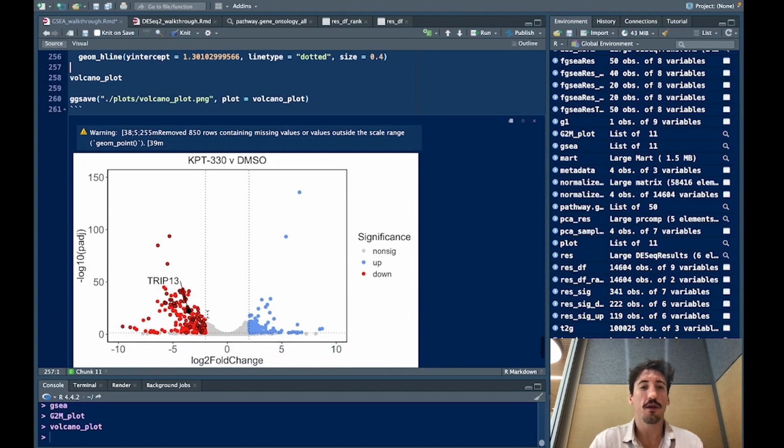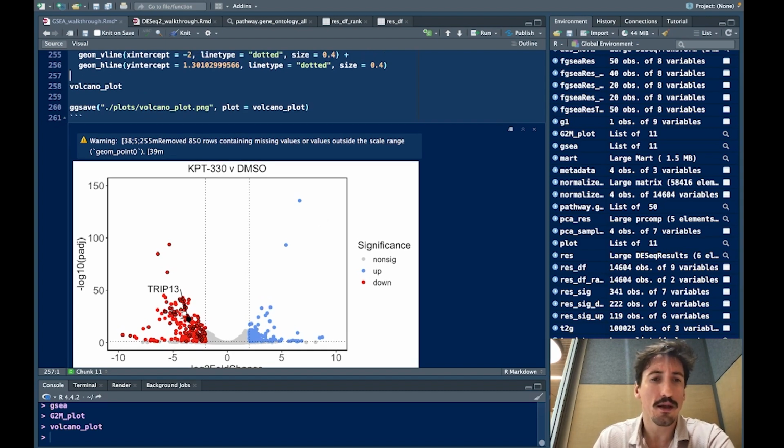And so really, this is the volcano plot, and any of the points that fall in these left or right upper quadrants, those are the ones that are significantly downregulated or significantly upregulated. You can see that I've labeled the colors like I said. Red is down, blue is up, and in these black hollow circles, those are the G2M gene sets, the ones we got from MSigDB, and we've overlaid that on top of the volcano plot.